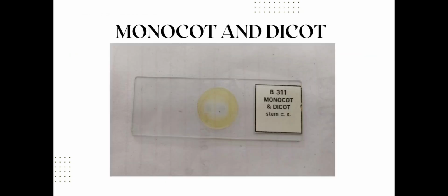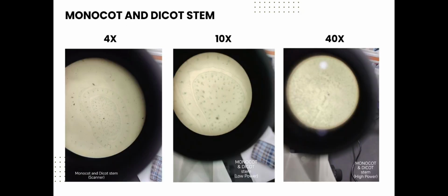Monocot and dicot stem CS. The scanner view displays the entire cross-section of the stem. You can clearly see the epidermis, the outer layer, the cortex, and the vascular bundles scattered across the ground tissue. Low power shows a clearer view of the vascular bundles scattered throughout the stem section. These scattered vascular bundles are a typical feature of monocot stems. Dicot stems usually have vascular bundles arranged in a ring.